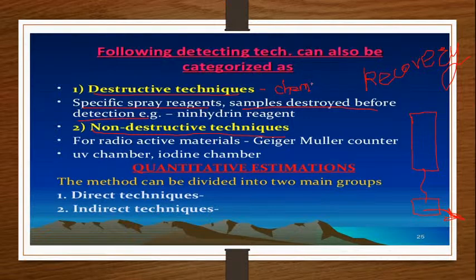If any compound has been changed from its original form to another chemical form, it cannot be called the original chemical. Just because of its capacity to convert the molecules into a different molecule so that it can be detected and visualized, it results in destruction of the sample, and hence the sample cannot be analyzed further, for example by spectroscopic methods.